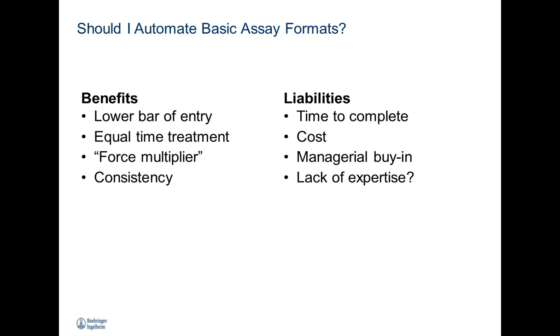You don't need to be an automation expert in order to successfully put an ELISA or an ELISA-like assay format onto some kind of an automation. One of the greatest benefits of automation is equal time treatment of samples. And we'll get into that a little later when we talk about the scheduling software.